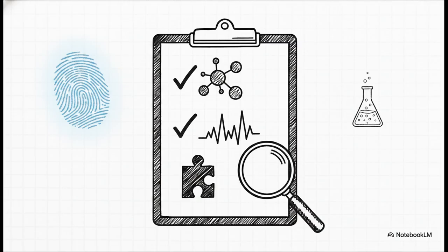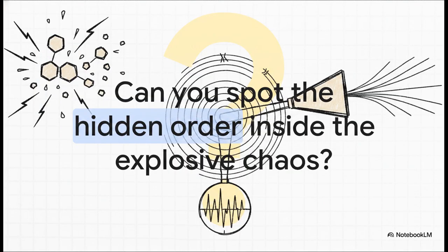Now, why does this all matter? Because these aren't just abstract textbook rules. This is literally the toolkit every analytical chemist uses to identify unknown substances in the real world. Which leaves us with this final thought. We started by picturing high-energy electron collisions as just total chaos. But knowing these predictable, mathematically precise rules of destruction, how will you now look at the elegant, hidden order inside a mass spectrometer? Even when breaking a molecule completely apart, science finds a beautiful, readable logic.